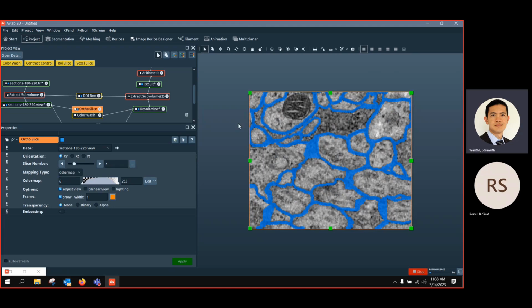Yeah, exactly. And also, for example, if you have an image, just to give an example like this image, if you have mitochondria here, always somewhere around here, then you cannot trust that the model is going to learn this feature properly. So next time when you see a new image that the software hasn't seen before, they only remember by heart, and only try to predict the features that are in this region. That's why we have to give them augmentation, creating fake images by rotating, flipping, shearing, just to make sure that at least they understand the global features of this mitochondria, and that it's not only on the top, it could be anywhere.